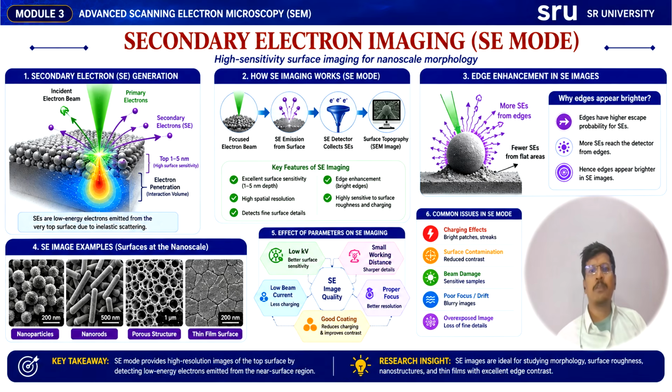Let us now discuss one of the commonly used imaging modes in scanning electron microscope, that is the secondary electron imaging.